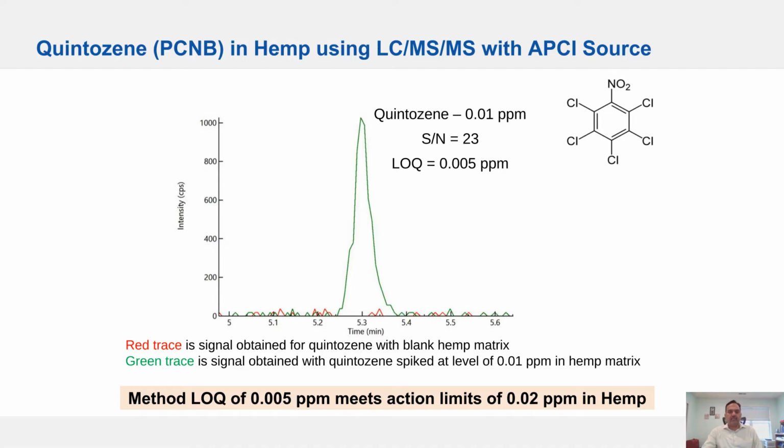It might be possible that one compound will ionize better with ESI or it will ionize better with APCI ion source. So based on the ionization efficiency, we choose an ion source to analyze that compound. But only for this compound, we do not get any signal with ESI ion source because of its structure. We can only ionize this compound using APCI ion source.